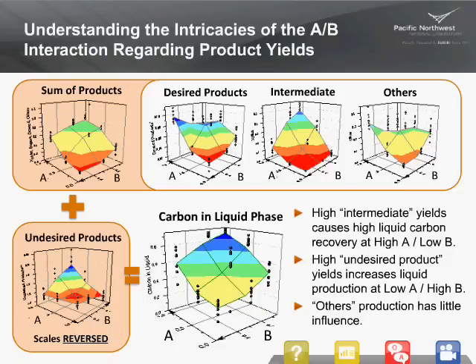and using these multivariable surface charts. It's just sort of another way. From here, like I said, you can go to ratios and a lot of different things. This is just a very small glimpse, so if you have questions on other things that you can do, like I said, I hope you write in and let me know.